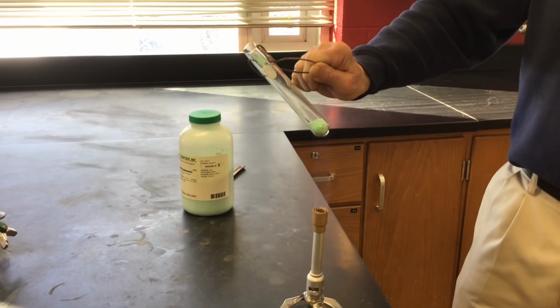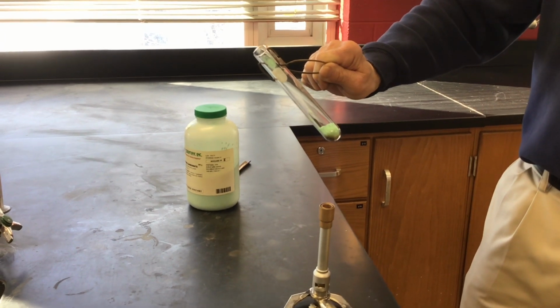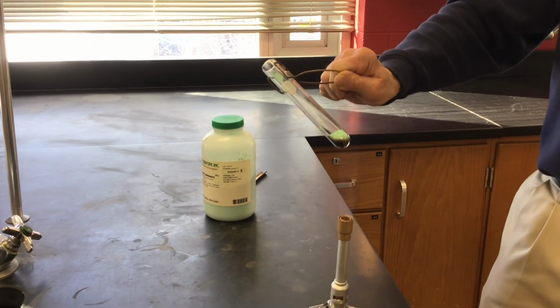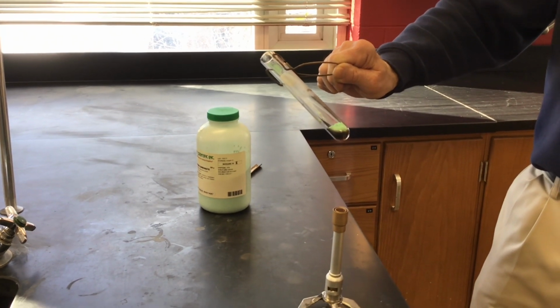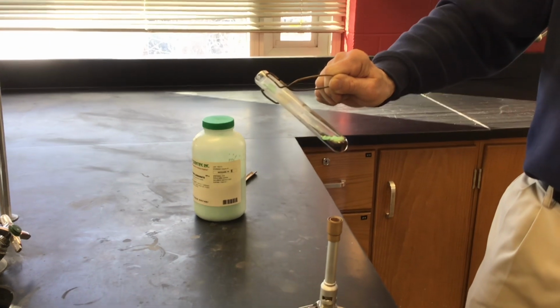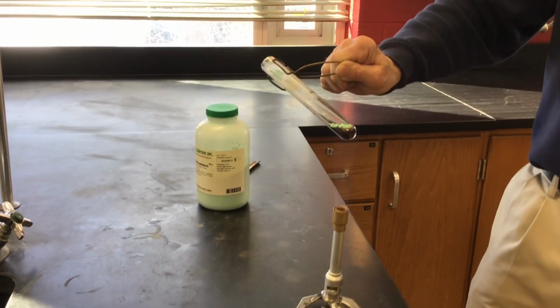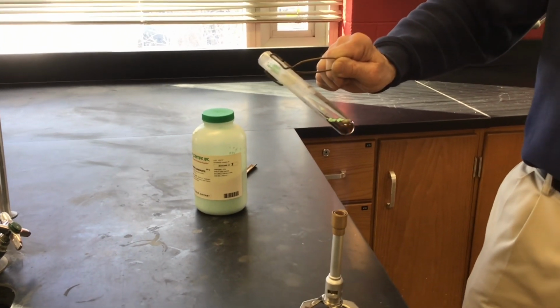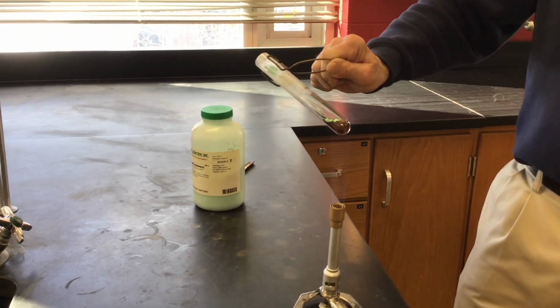And here's a matter of lab technique too. We normally will heat things sideways. Like you see, Mr. Hevel does not have it straight up and down, it's sideways for even heating. And we normally will aim it toward a wall and not toward our lab partner. We didn't have a chance to go over the lab safety things, but that's normally the way that we heat things up.